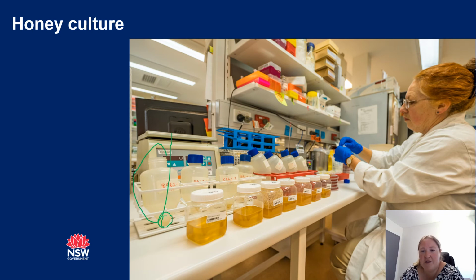From that we then heat that sample that's right down the bottom, which hopefully has either no spores or all the spores from that sample in the bottom of that. We heat it up and we place it onto these plates up the back here, and they are our selective plates which help us knock out other bacteria and help grow the Paenibacillus larvae.